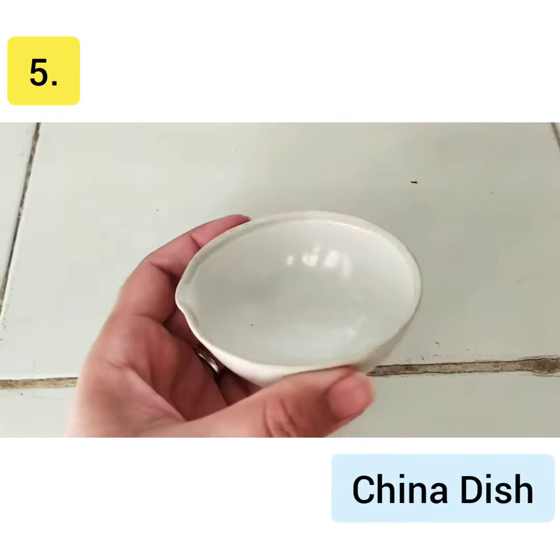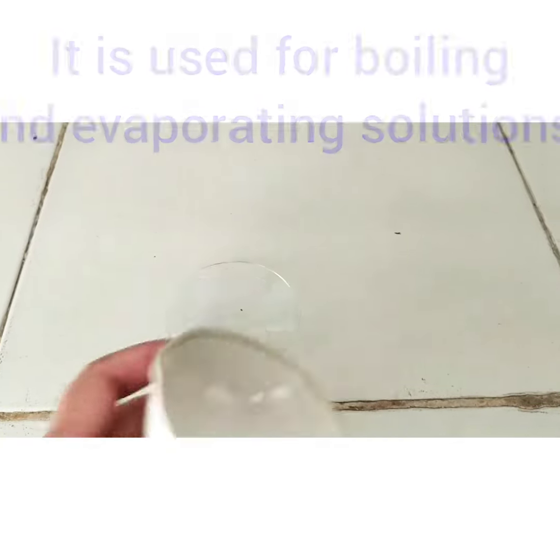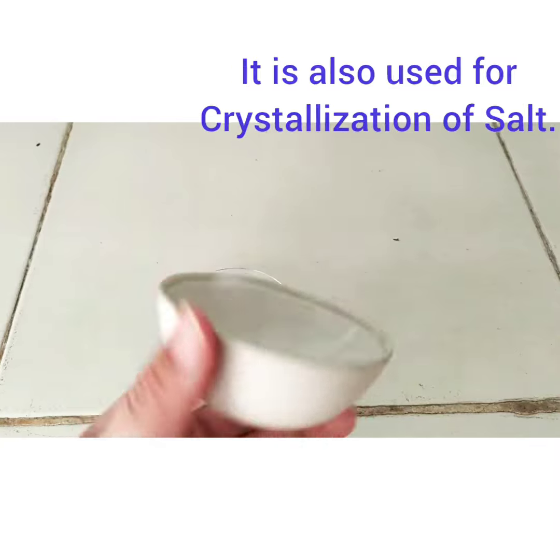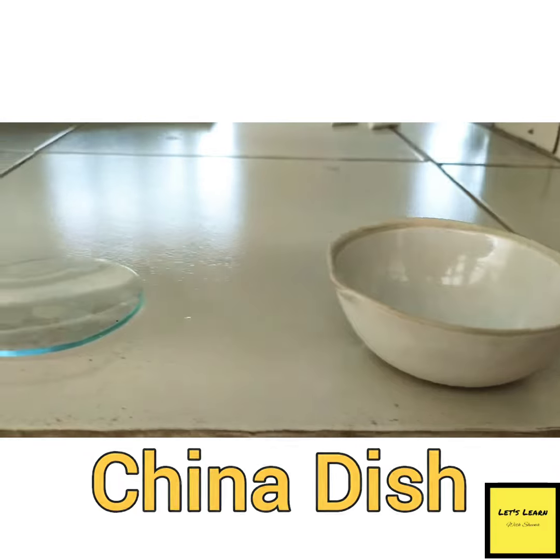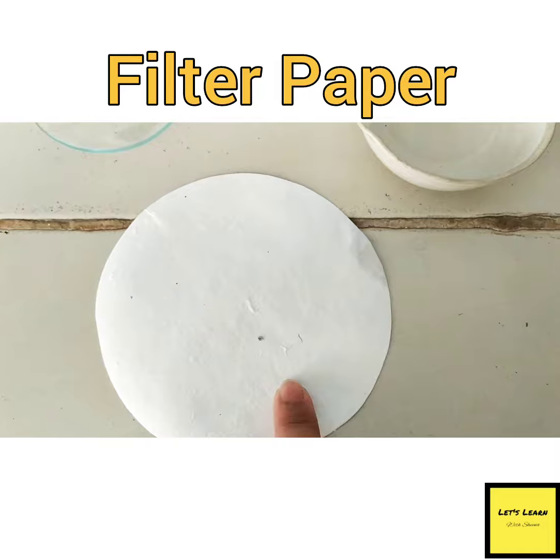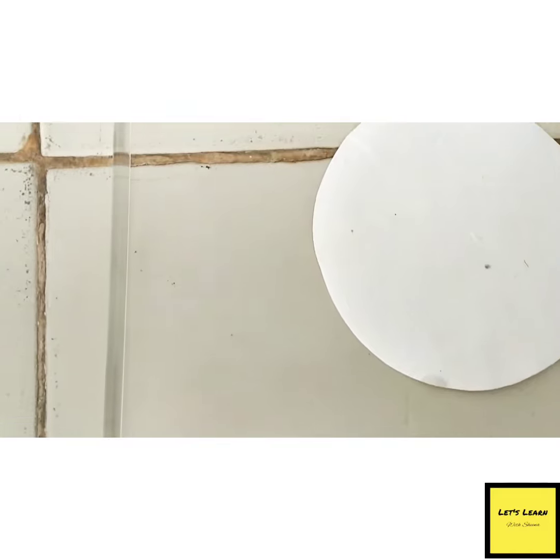Number 5. China dish. It is used for boiling and evaporating solutions. It is also used for crystallization of salt. China dish, watch glass, filter paper, glass rod, test tube.